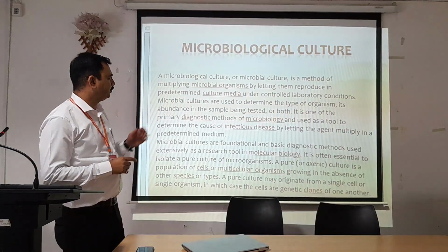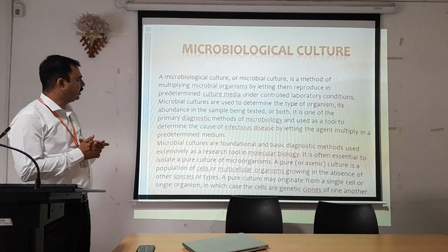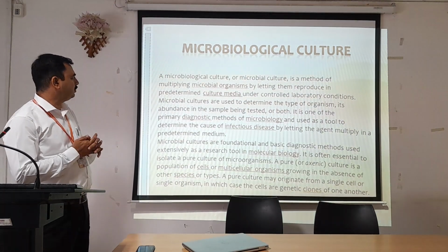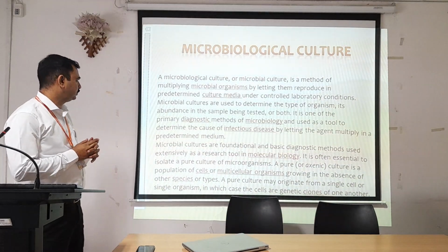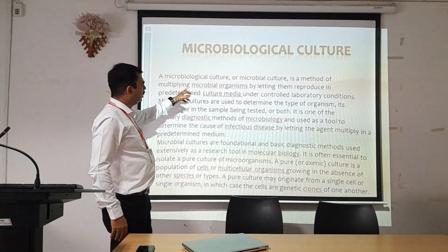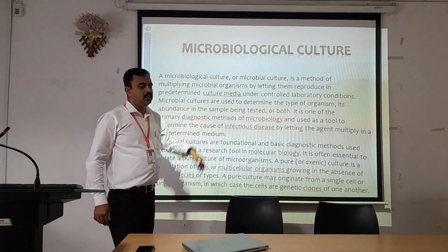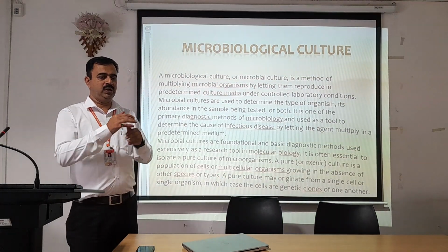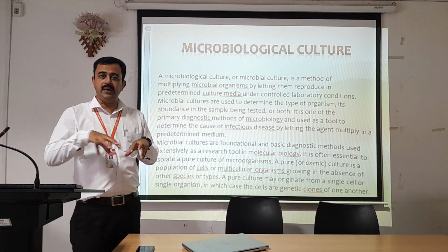So, let us understand that a microbiological culture or a microbial culture is a method of multiplying microbial organisms by letting them reproduce in predetermined culture media under controlled laboratory conditions. See, when the organisms are there in the sample, we need to isolate the organisms in a higher amount.